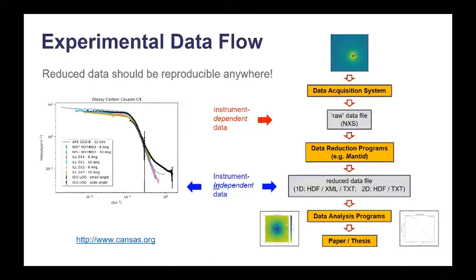The other thing to remember is that in small angle scattering, the intensity axis not only has units, it can be put on an absolute scale with a suitable calibration sample. Or conversely, such a sample can be used to check that the reduced data has, in fact, been suitably corrected. So when you go to do an experiment and your instrument scientist tells you at the start that they're going to take an hour to do a calibration, now you know why. It's to your advantage.